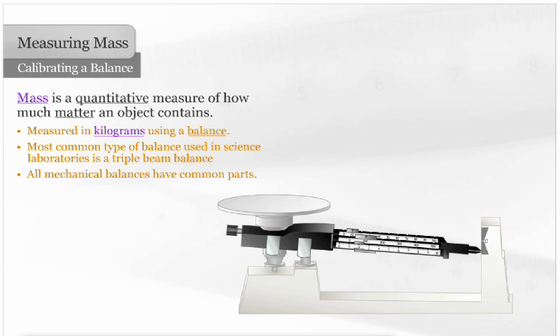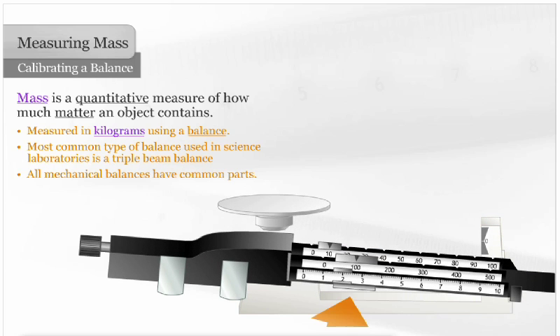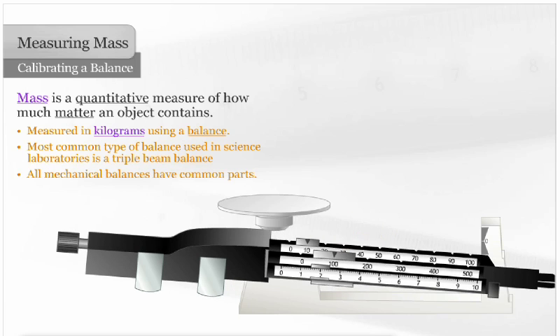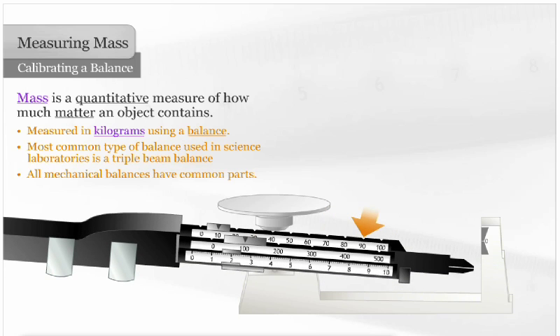A triple beam balance actually has three riders: 1 gram, 10 gram, and 100 gram. It also has notched beams, a pointer, and an indicator line.